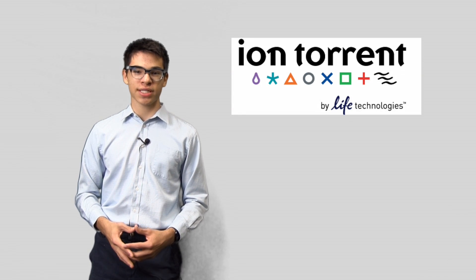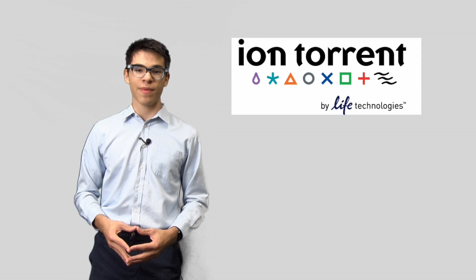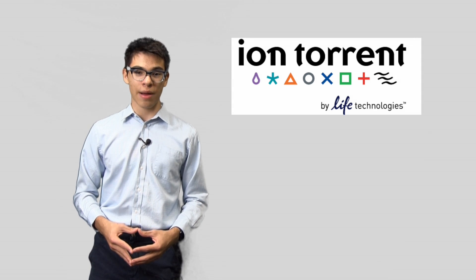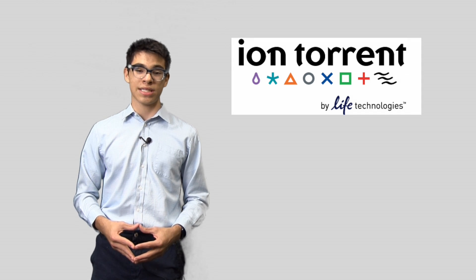Hello everyone, I'm Stephen and you're watching Stephen Love Science. Today we're at Life Technologies Headquarters in Carlsbad, California, where our cameras have been allowed to enter their Ion Torrent Laboratory, where scientists and engineers are constantly striving to improve the way we sequence DNA.